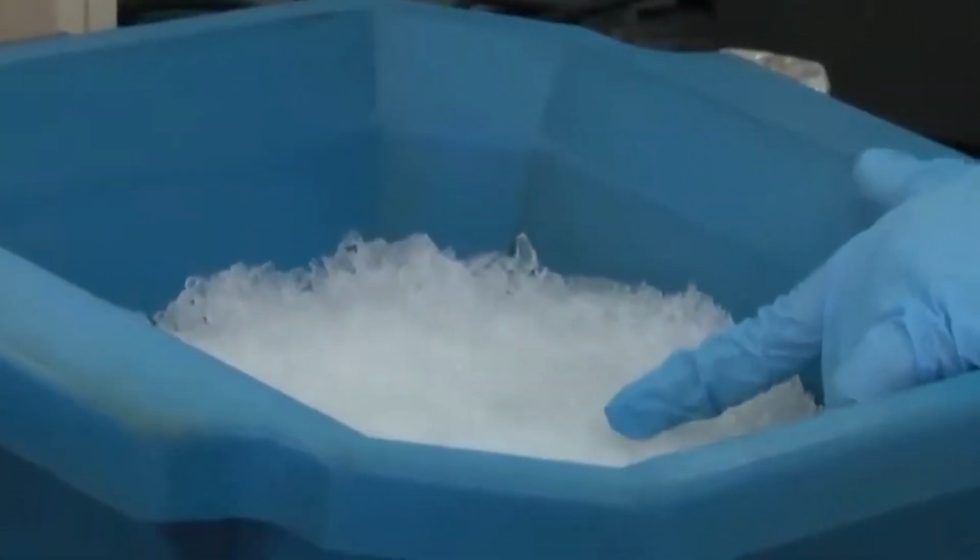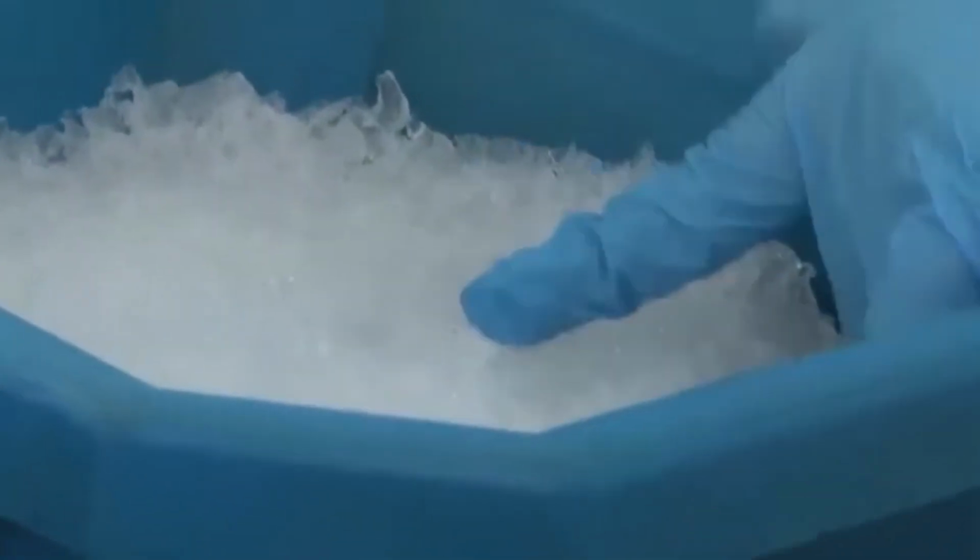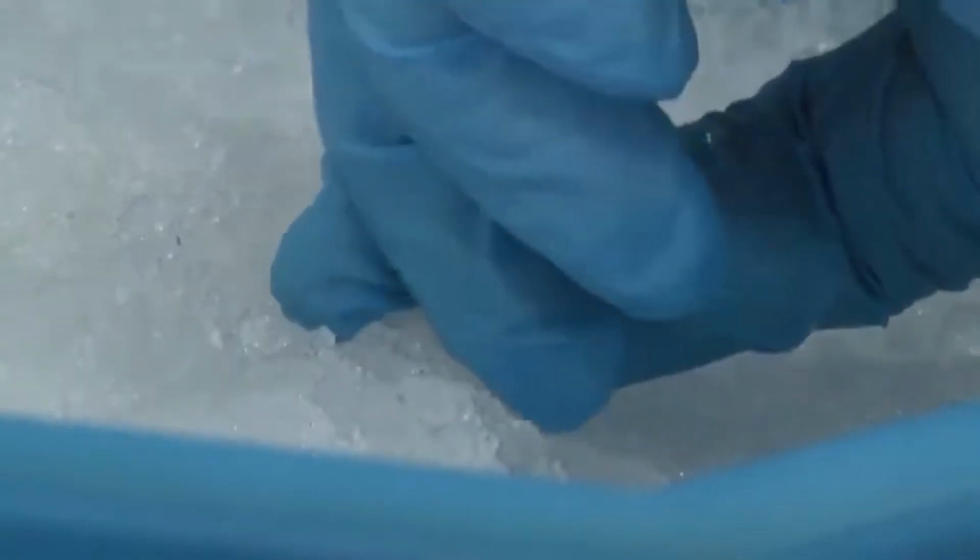But now that that is done, I am not going to take out the vial of competent cells. I will keep it embedded in ice, because I do not want it to warm up. So, if you are a very fast worker, you could just take out the vial, immediately add the DNA, mix it and put it back. Some people do it that way, even I do it that way, but for this demonstration purpose, I will not really take it out too much.